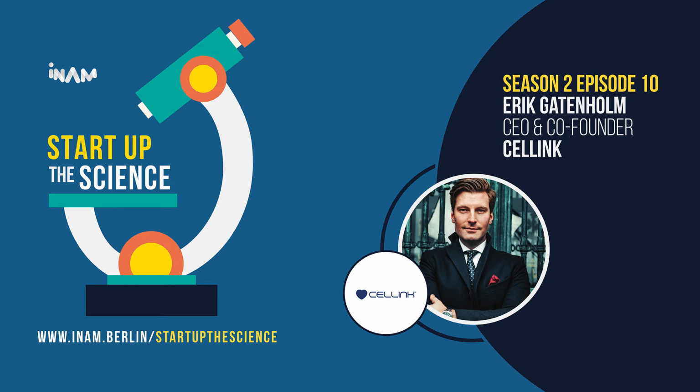Right. So it's more used in the testing, but not as much in the vaccine development. I would say it's mainly used for drug discovery or specific treatments and understanding the correlation between a new treatment and tissue. And when it comes to developing a drug or vaccine for a virus, that's a different beast. It's a little bit different world for these types of technologies.